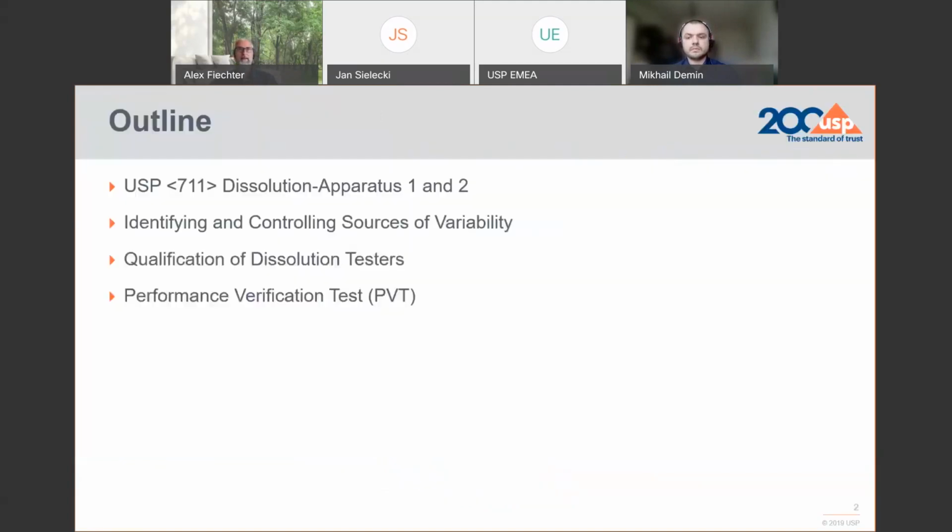Again, let's dive into the outline for today's webinar: to discuss from general chapter 711, Dissolution, apparatus 1 and 2, because they are an essential part of the qualification using the PVT test procedure.